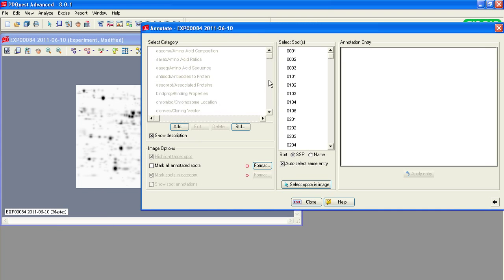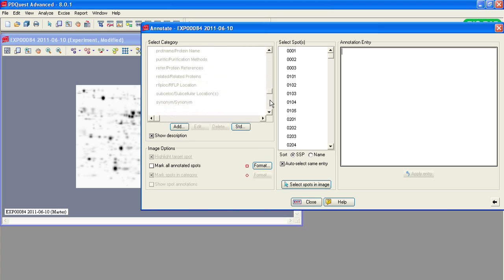These categories refer to protein names, amino acid composition, binding properties, translational regulations, and other properties of proteins.